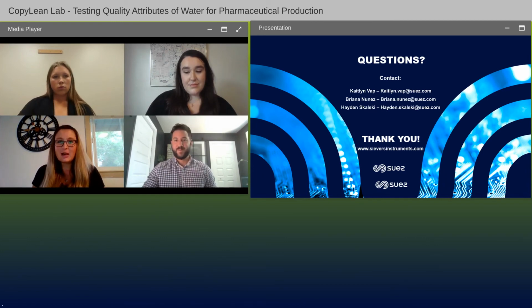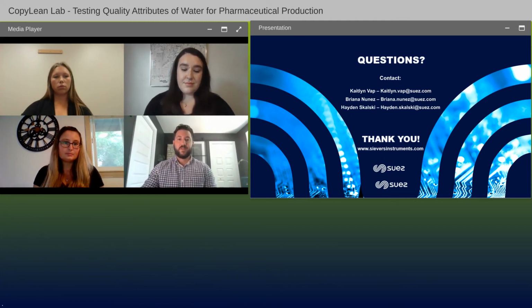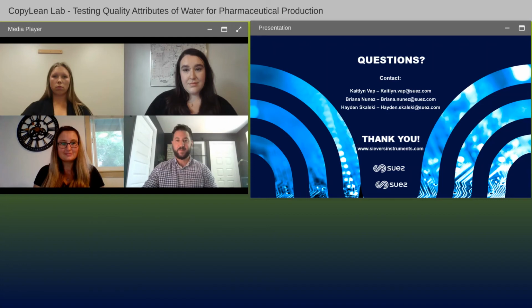Great, thank you. We'll go ahead and keep going with you, Hayden. This one ties into the same thing. How do you validate water samples with the Sievers Eclipse? This validation process, especially for water, is super easy. Since water is mainly tested at a 1-to-1 dilution or neat, undiluted, you won't have to make any dilutions. So you can basically just take all of your water samples and test them on the Eclipse. And you can do a simple comparability study to ensure that your water samples are going to be compatible with the Sievers Eclipse. So it is a pretty easy, straightforward process for water.